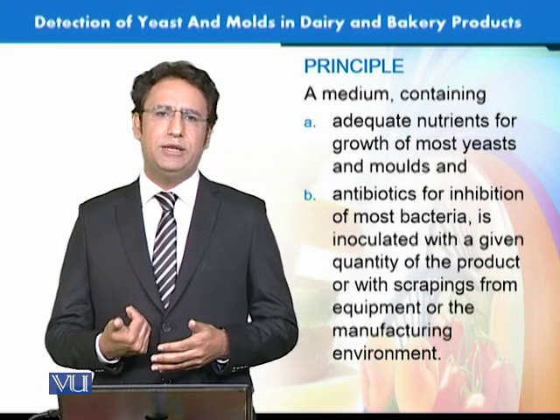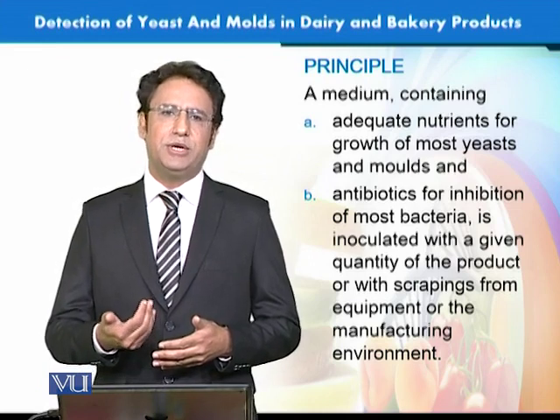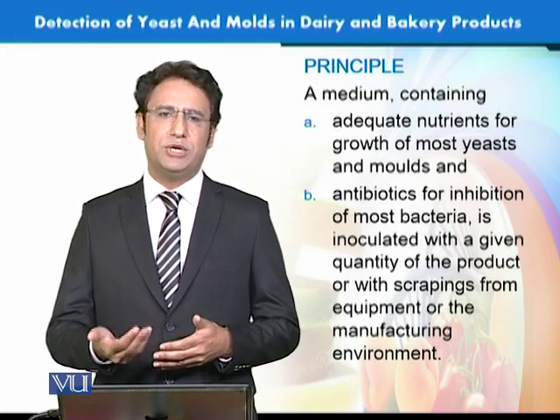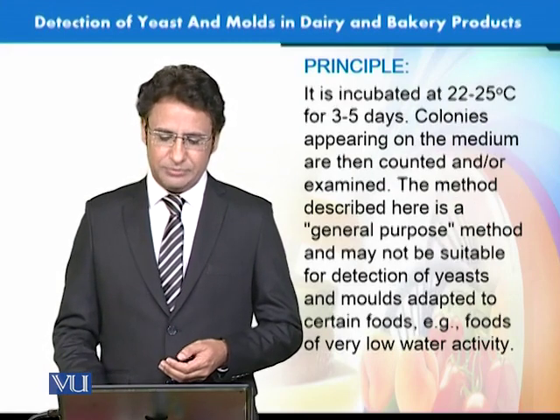If you don't add antibiotics, other bacteria can also grow along with yeast and mold, and it would be difficult to enumerate the yeast and mold in the food. So antibiotics are an essential component of these media.